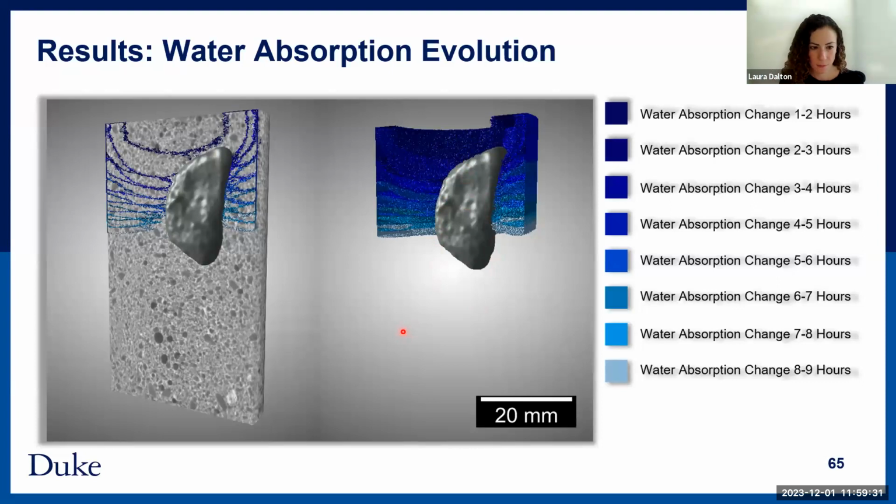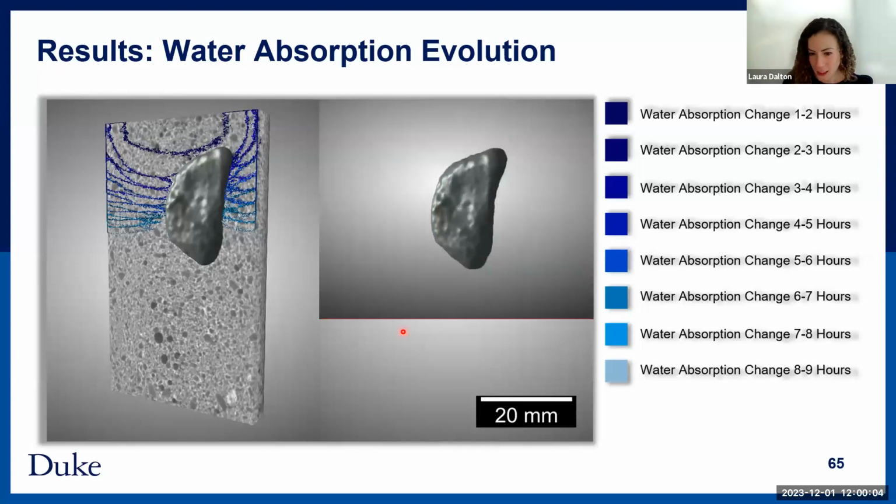But we did see that the water was kind of avoiding that space in a way, which I've thought about a lot. I wonder if it comes back to the fact that it's more porous, there's more air, which in theory would actually delay the advancement of water to that point under capillary effect conditions. If you're flowing through something, of course, and it's interconnected, that should increase the percolation of the water. But anyways, that's one thing that we studied.